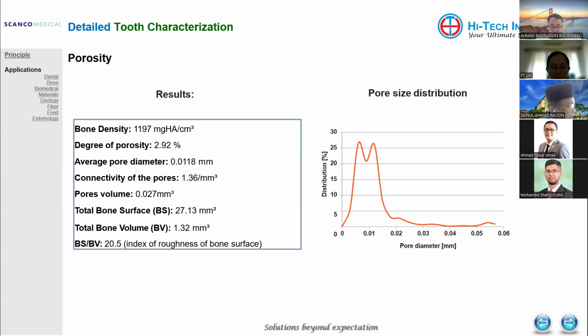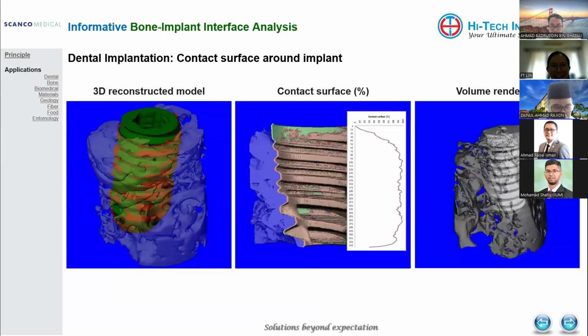Next, you did mention osteointegration, where the implant marries with the bone, where the implant is stable. You have that osteointegration with regards to color coding.